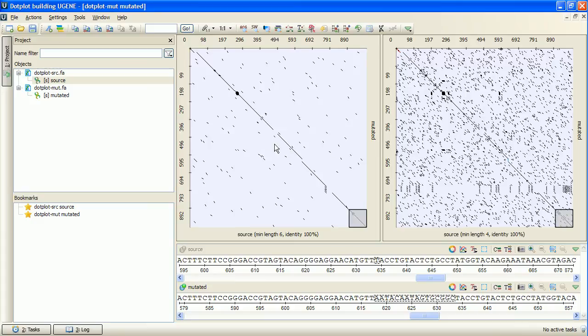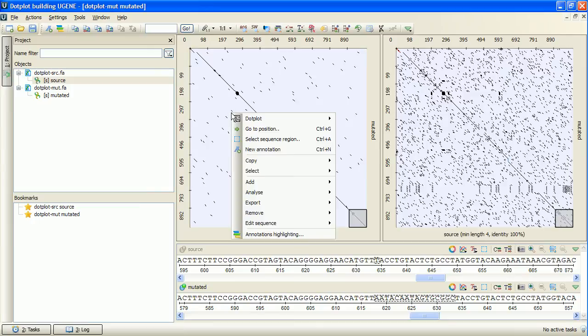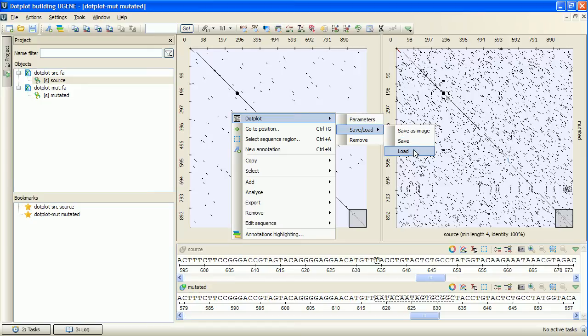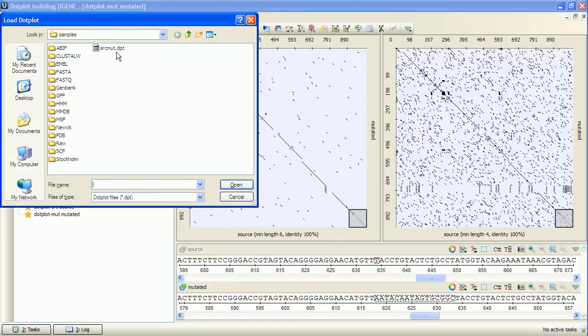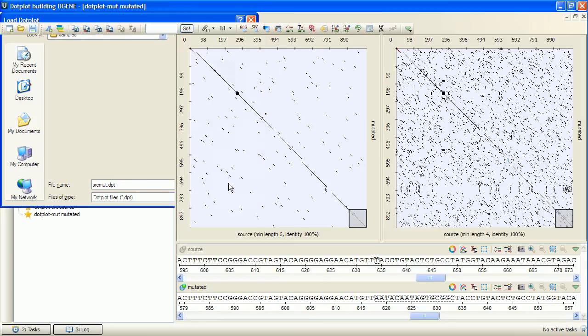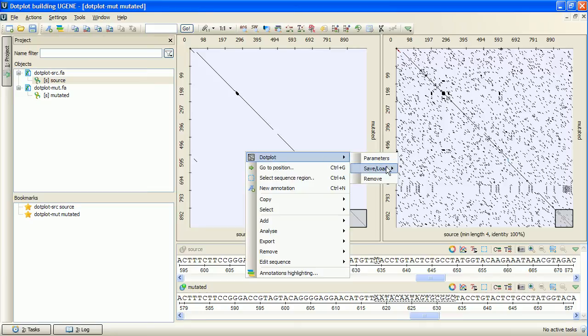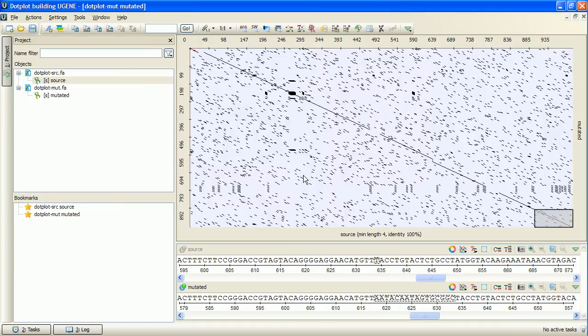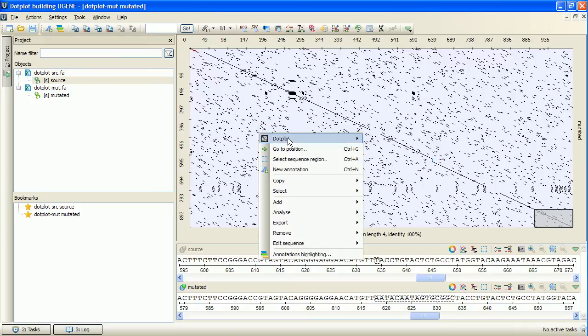Now I can save the dotplot as an image or in a native format by right-clicking at the view and selecting dotplot save/load items. A dotplot saved in native format can be loaded from the dotplot view. Unnecessary dotplot views can be unloaded by selecting dotplot remove. Note that the parameters of a built dotplot can be adjusted by activating the dotplot parameters menu item.